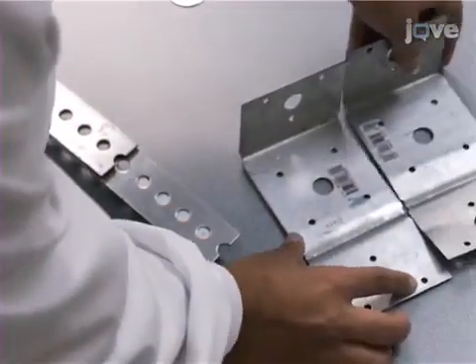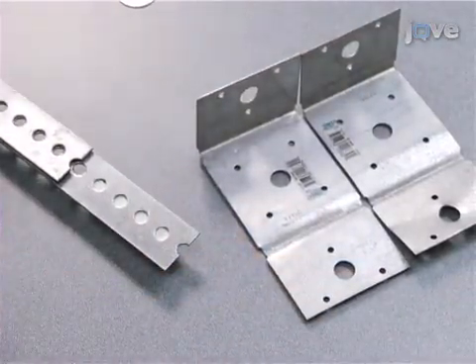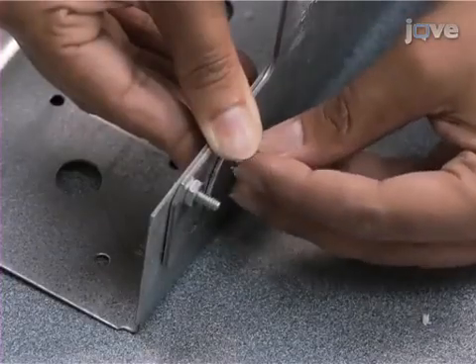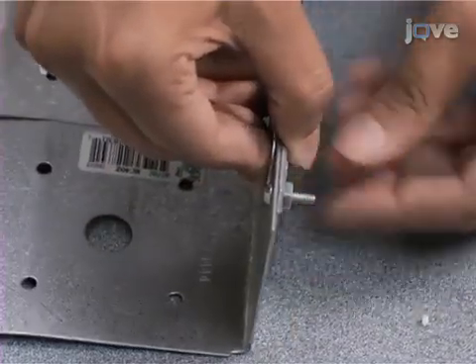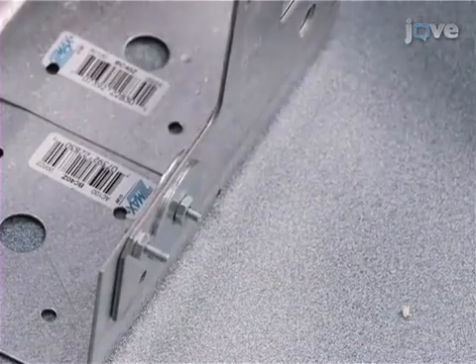Two such strong ties should be made to allow the device to retrieve five and a half by five and a half inch cryo boxes. Secure these with a strong tie T-strap using a crown bolt nut, washer, and screw to form the base of the cryo scoop. The device should now appear as seen here.